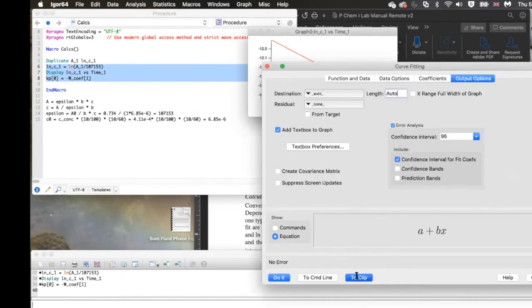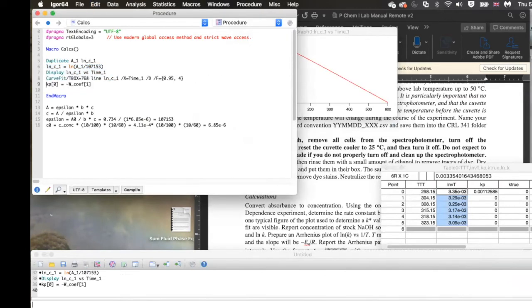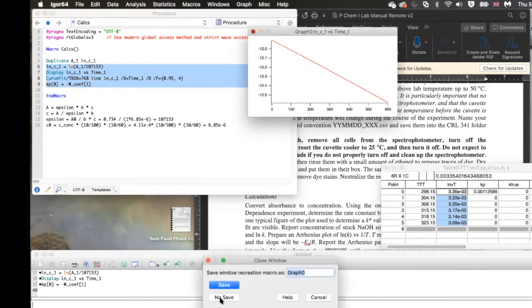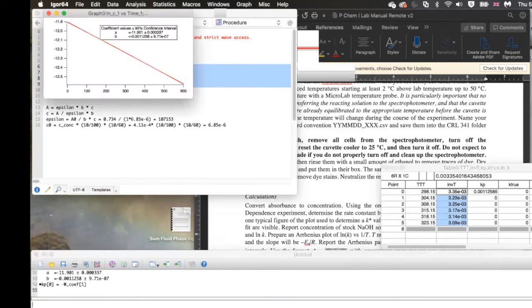But what I should have done was go to the clipboard, right? Pop in the values here. Just paste that in. Okay, so now I can take these. Let me just do it one more time. Let me get rid of that graph, right? Don't want to save that one. I'm going to make it again. See, easy as that. You paste into the command window, hit enter.